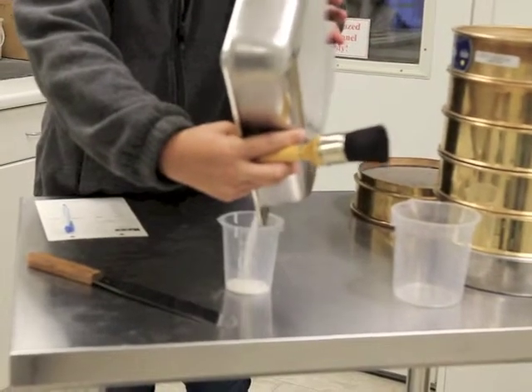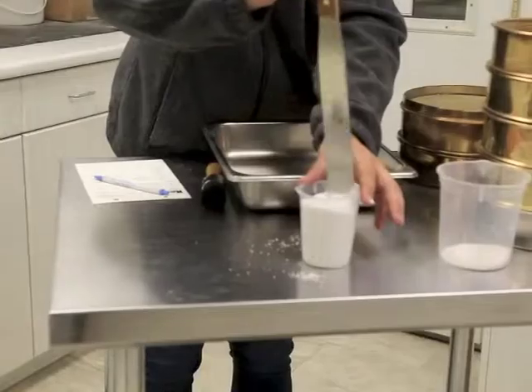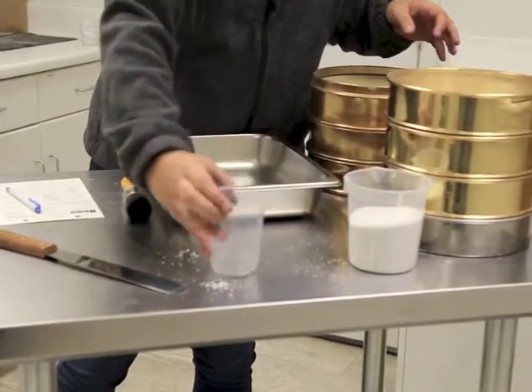graduated cylinder. The aggregate shall be poured loosely into the graduate without tamping or shaking. The surface is then leveled with a spatula and the volumes read within plus or minus 2 milliliters.